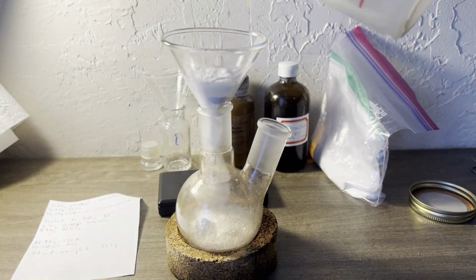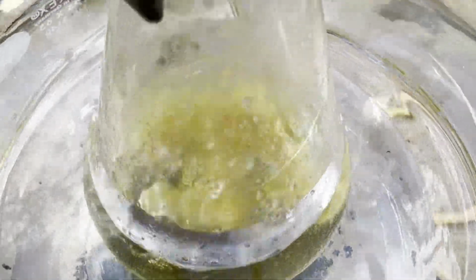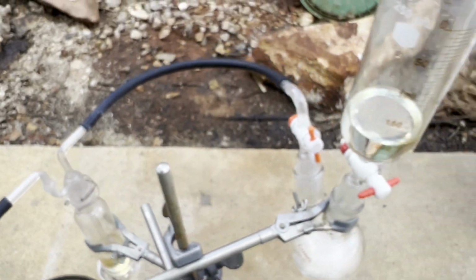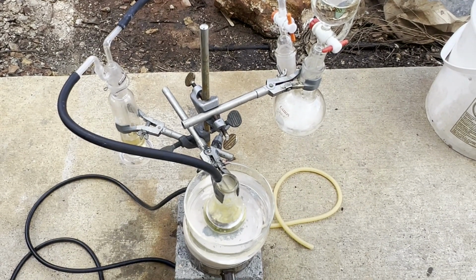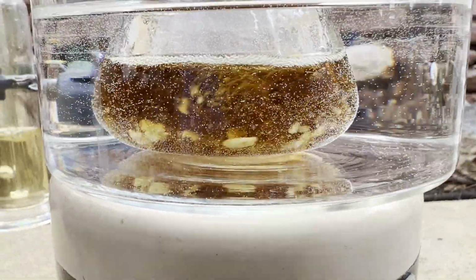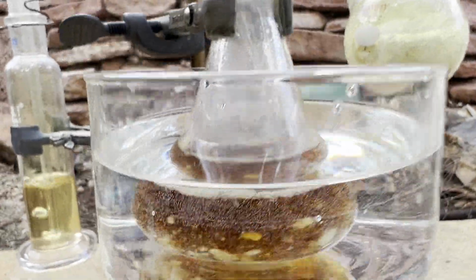This reaction went much more by the book. Heat was evolved to the point that the cooling water, starting at 15 degrees-ish, hit 35 degrees by the end of the addition of the chlorine. Hydrogen chloride visibly off-gassed significantly more than in the iron-sulfur catalyzed reactions. Not just as the white hydrochloric acid fumes, but as significant bubbling from the reaction mixture.